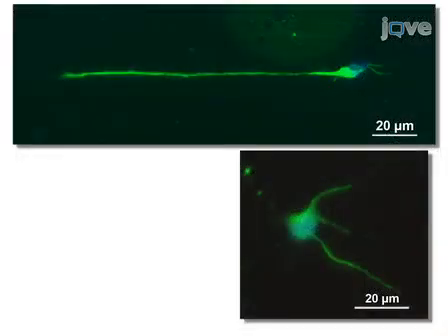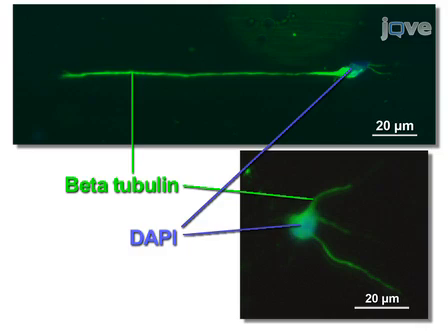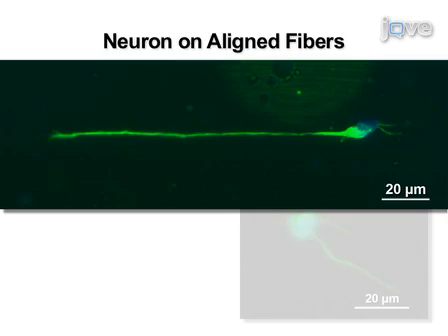These images show motor neurons stained for beta tubulin shown in green and DAPI nuclear staining in blue after 24 hours of culture on PLL-coated fibers and glass. On fibers, motor neurons typically possess few processes, which project from the cell body parallel to the direction of fiber alignment, which is left to right in this image.